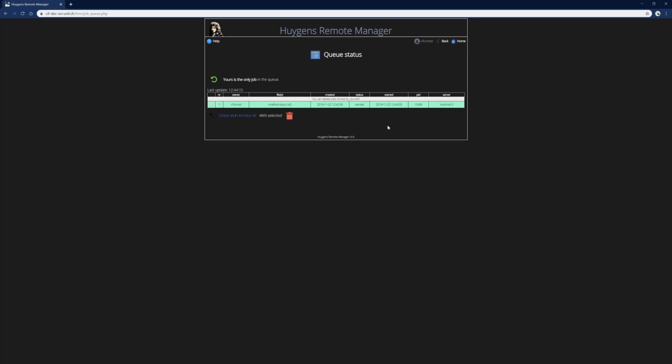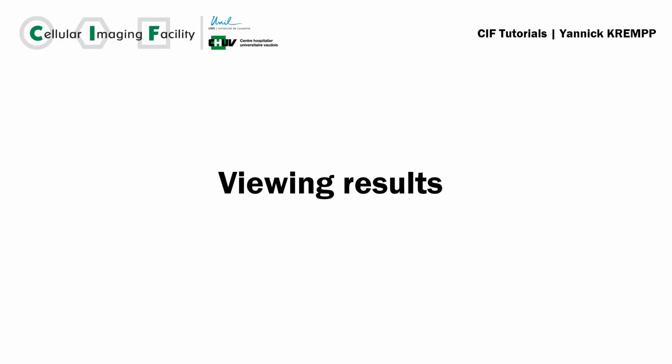Because this way there's less waiting time for everyone. So this is not a first in, first served system. So since this will take a while, let's just wait a bit, and then we will be able to review the results.